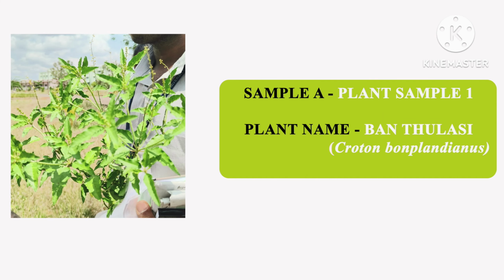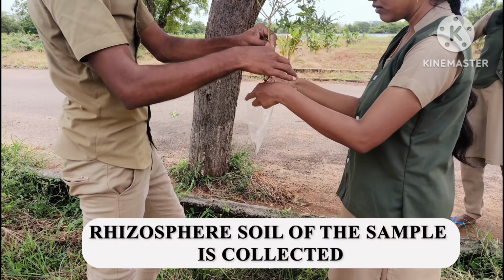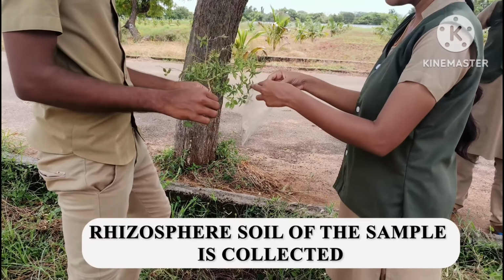Collection of samples. Sample A, Plant Sample 1, Banthulasi, Croton bonplandianus. Pull out the plant from the land. Gently tap the rhizosphere soil adhering to the root zone.